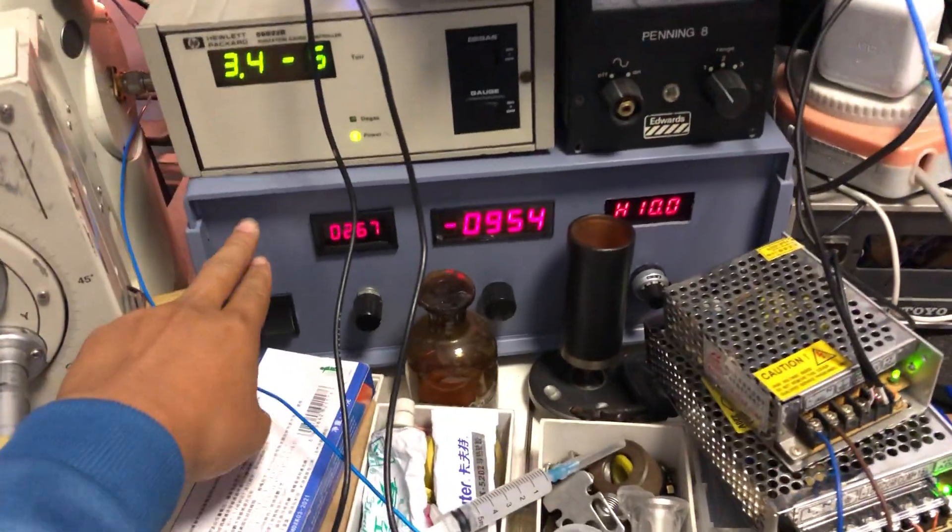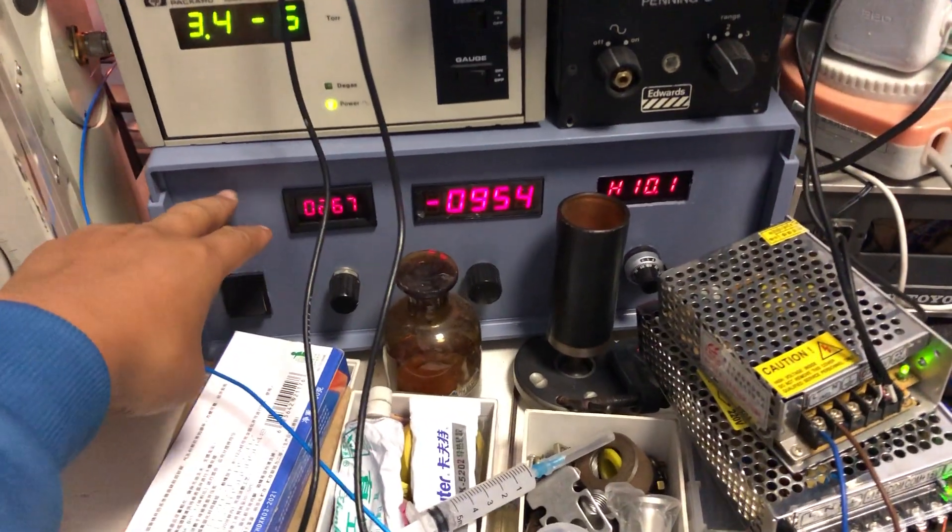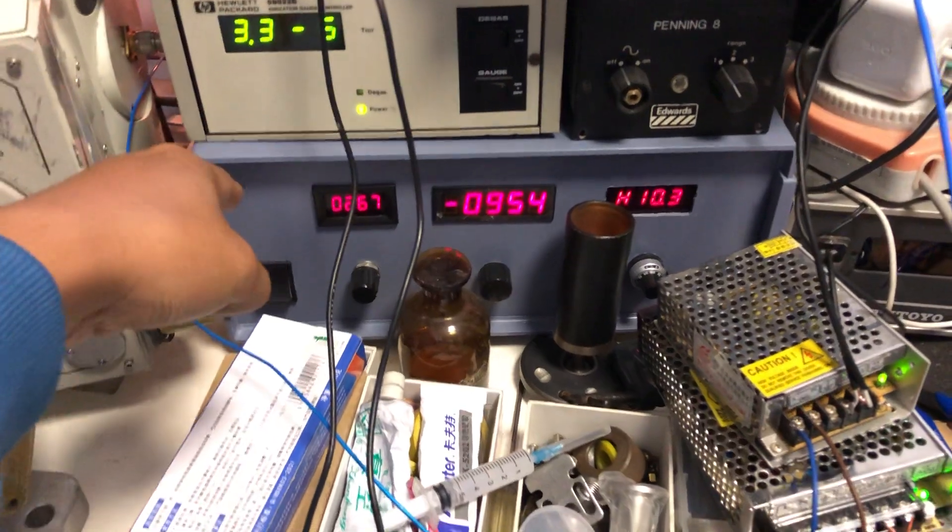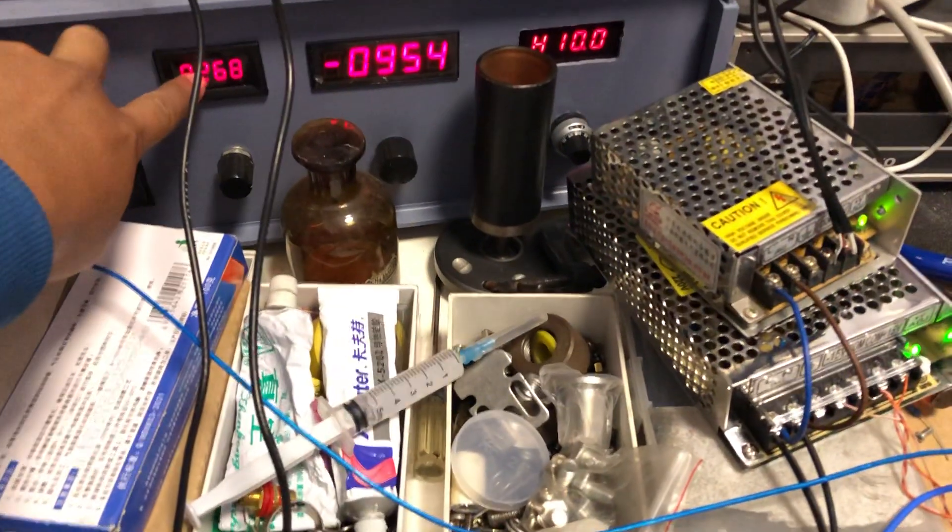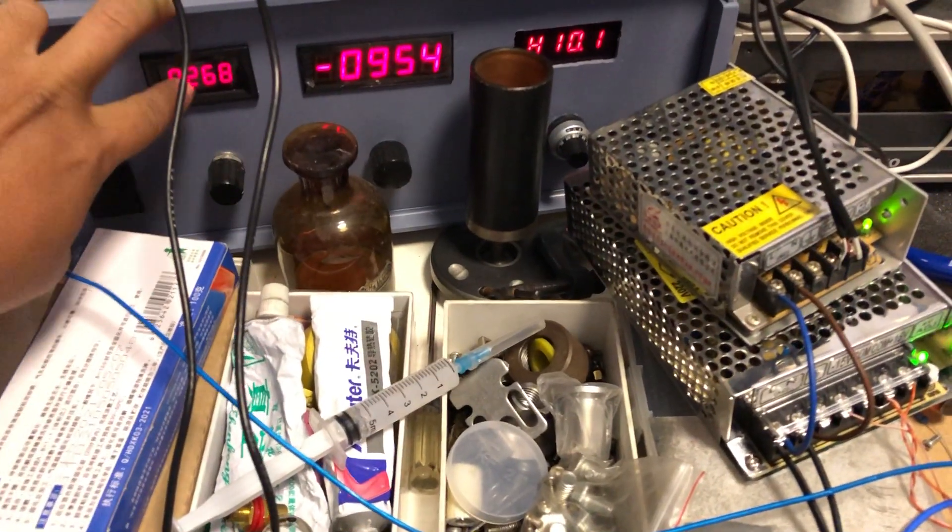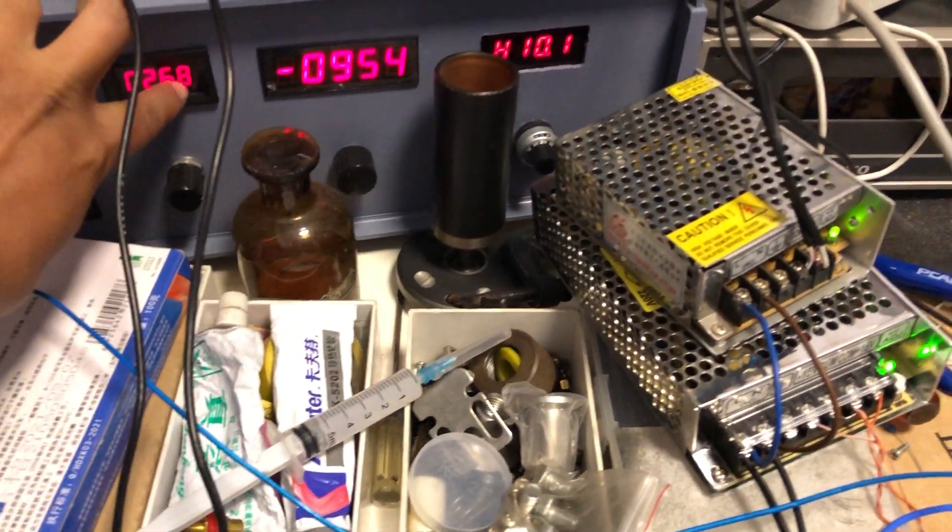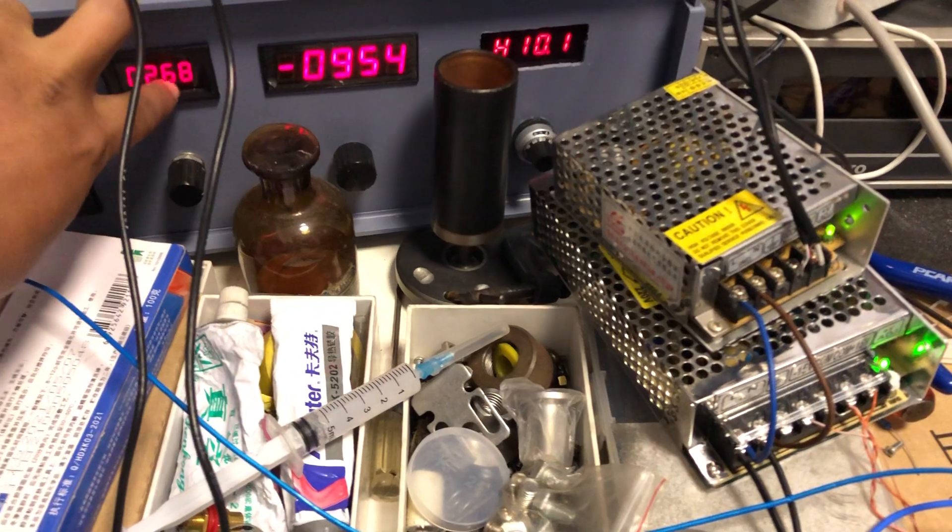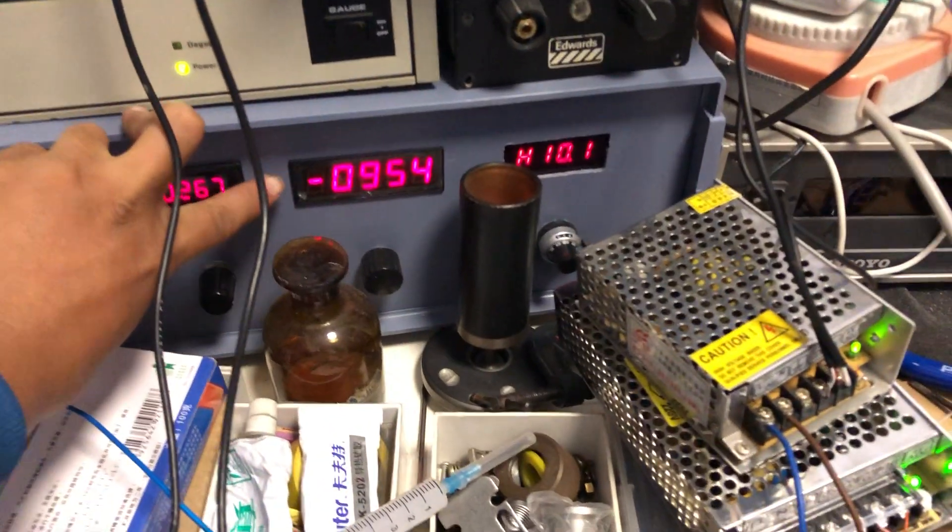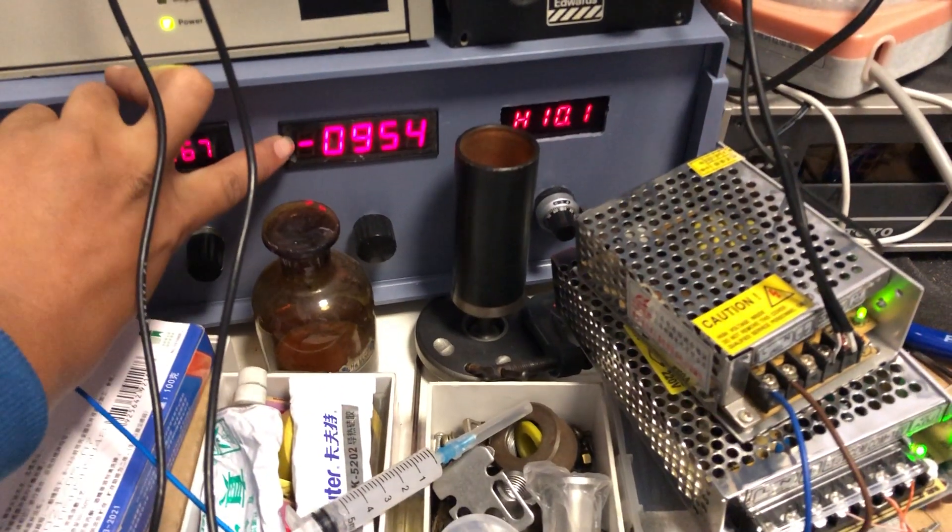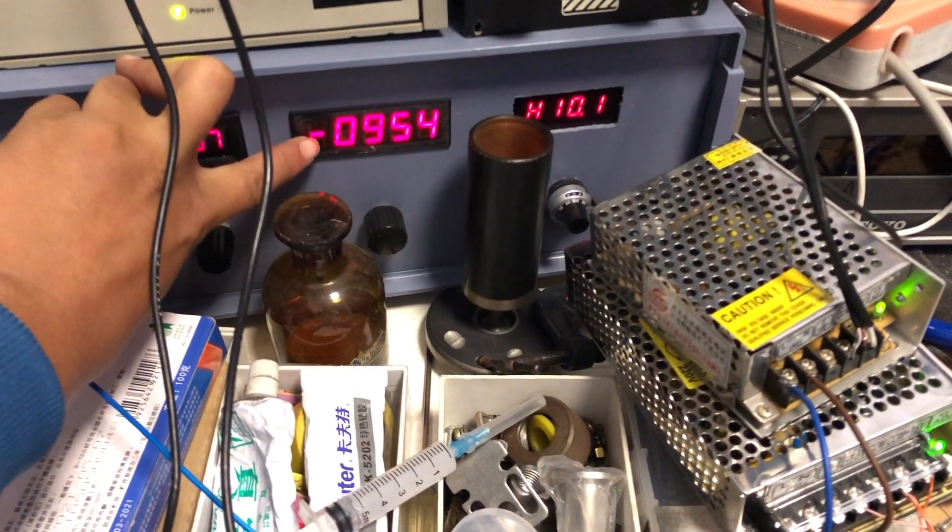And this is the secondary electron detector power supply. The power decay runs about 260 to 270 volts. The photomultiplier runs negative 954 volts and the scintillator runs about 10 kilovolts.